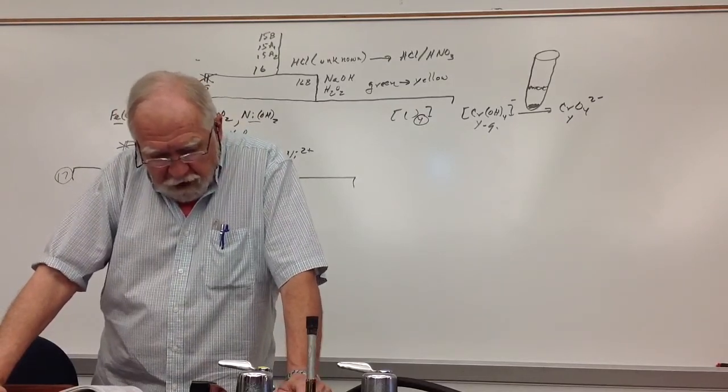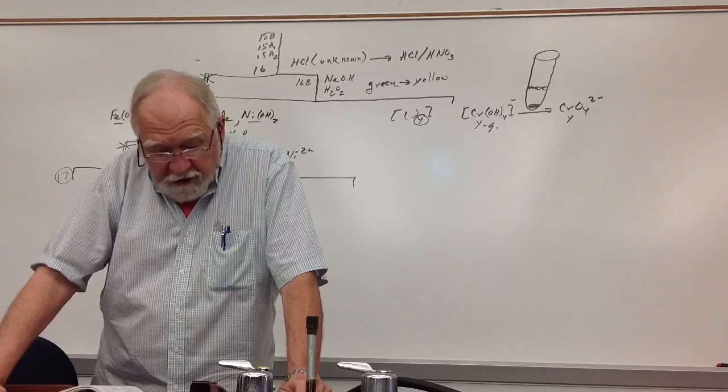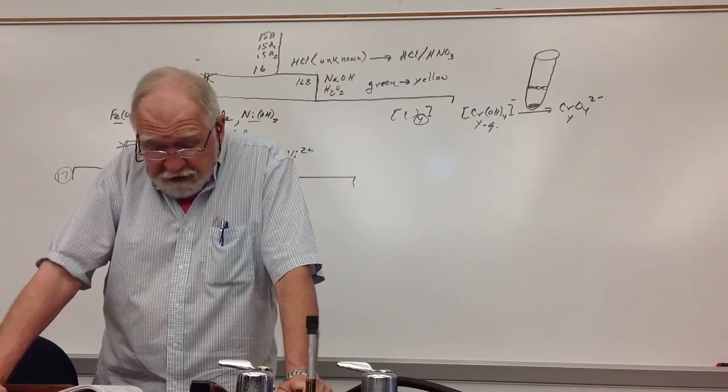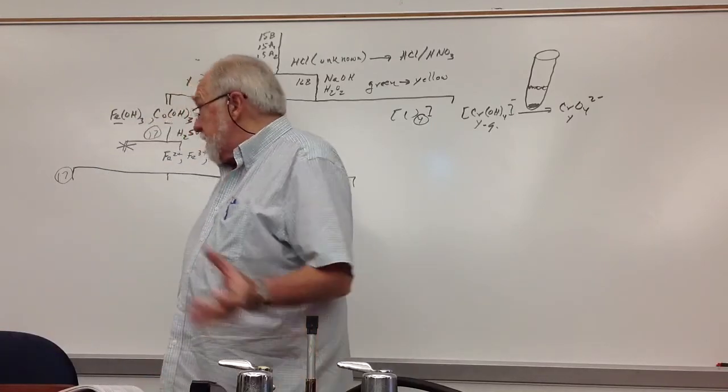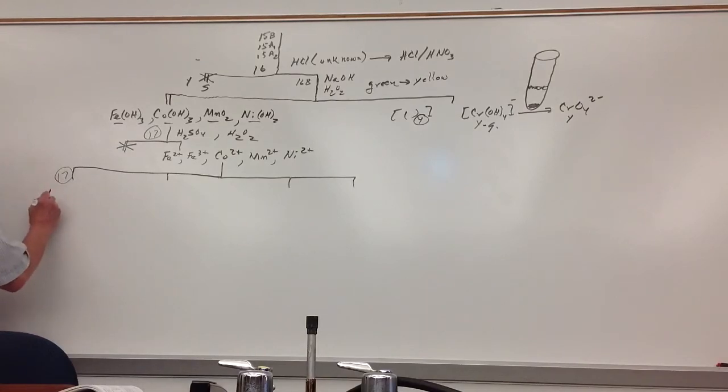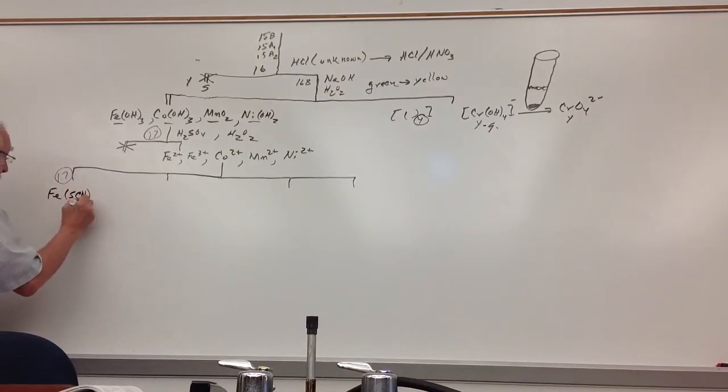You're adding 1 or 2 drops. If the color's getting darker, you add another drop, the same as the check for completeness of reaction. So you want to get the maximum dark red color. Notice again, just like we were talking about this morning, this goes in stages, and so some books put a 4, but we've added so much excess thiocyanate that this is the major one.